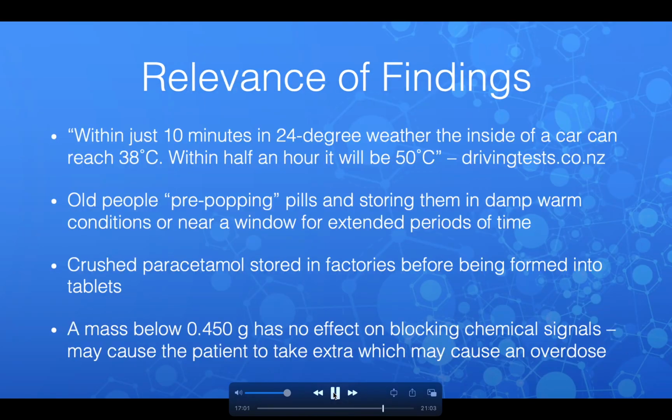These two spectra compare pure paraminophenol, which Douglas Pharmaceuticals did state to be the most prominent decomposition product, and the filter cake. However, we cannot see any pure paraminophenol in the filter cake, which would suggest that the conditions were not right for paraminophenol to be produced as a decomposition product.